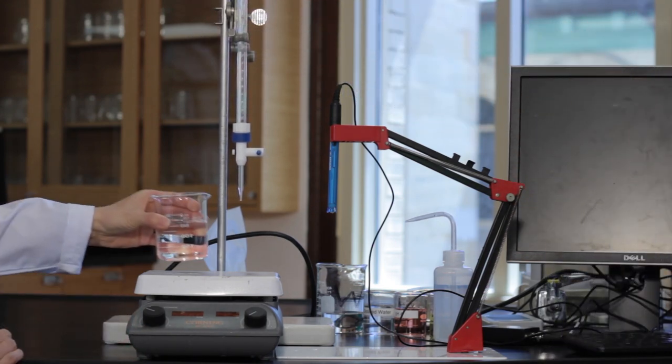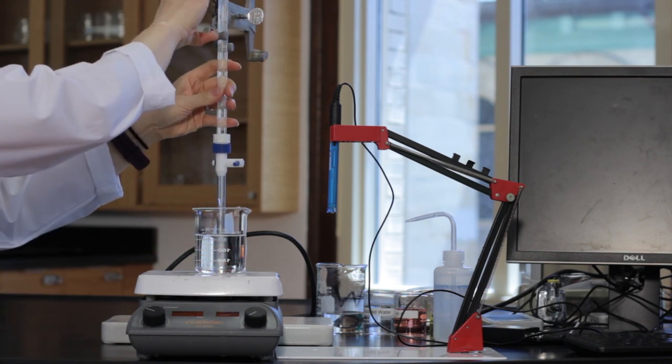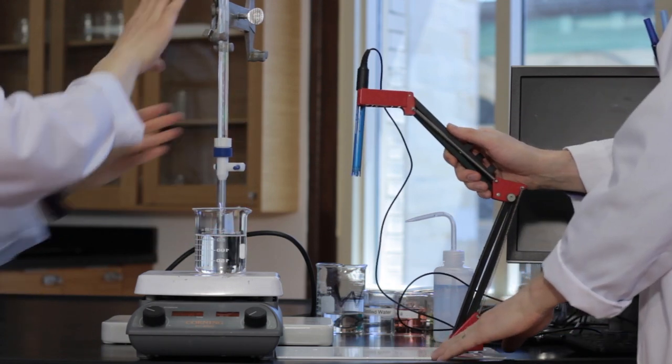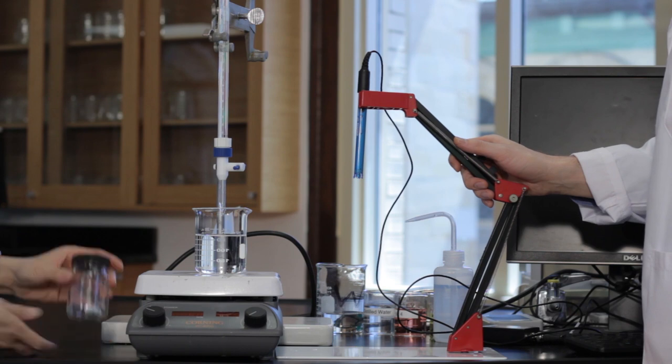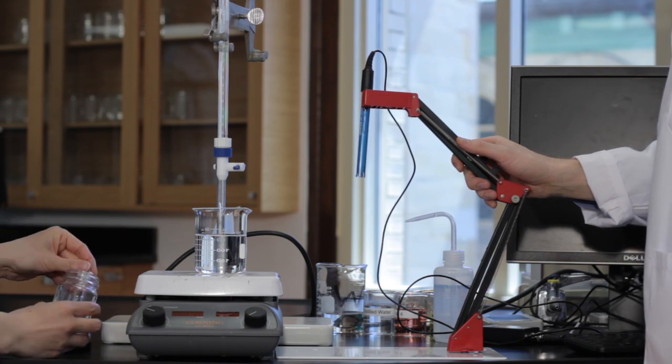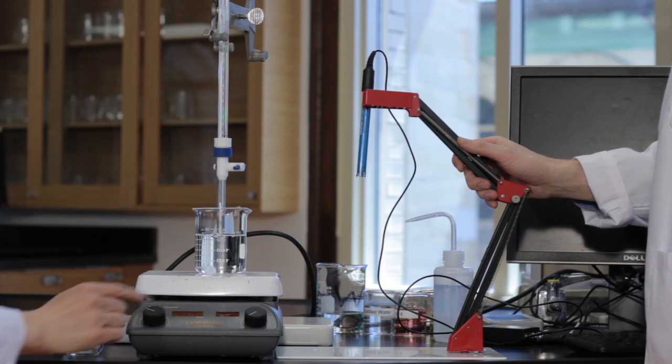Place the beaker of acid solution previously prepared onto a stir plate. Lower the burette so that the tip is at the top of the beaker to minimize any splashing. Add a magnetic stir bar to the beaker and stir the solution. Ensure the stir bar is spinning fast enough to mix the entire solution but not to a point where it's splashing.